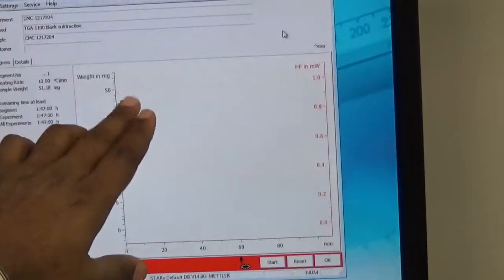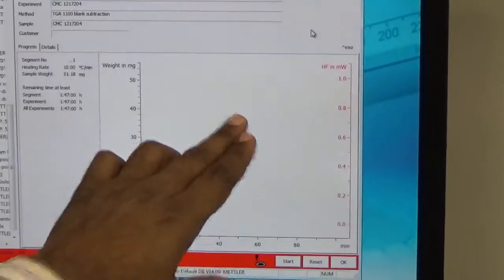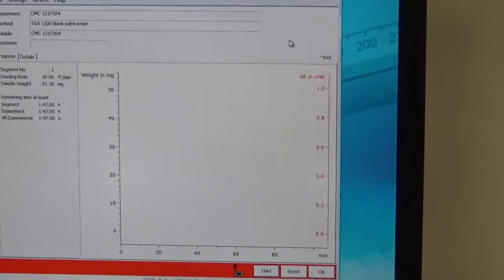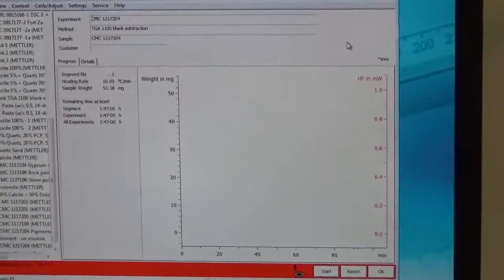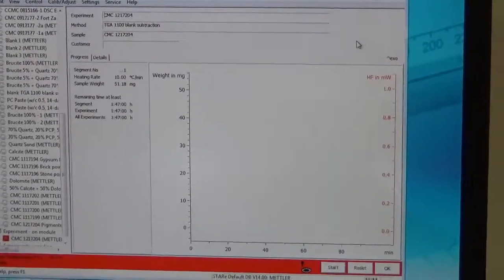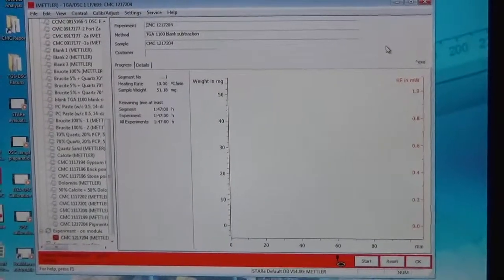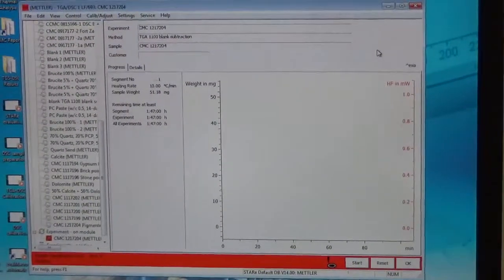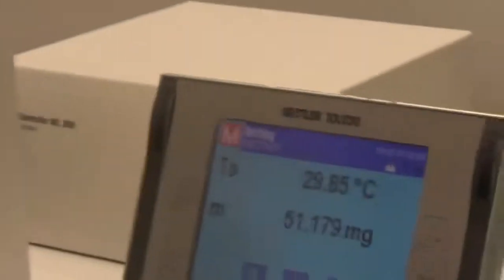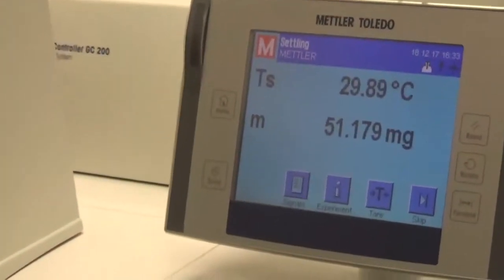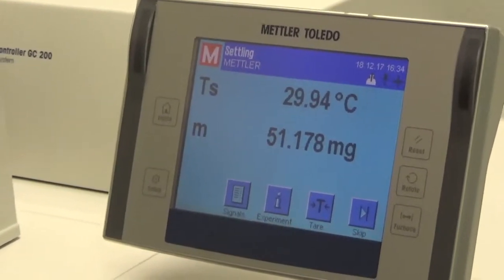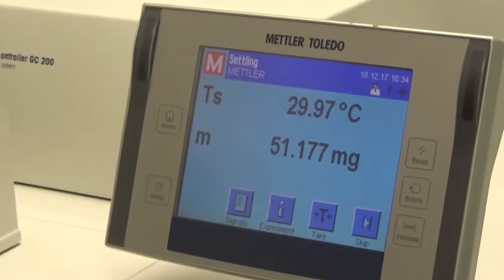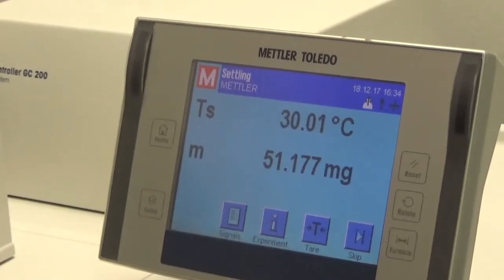When the plot starts, it shows the weight changes, and when there is a significant weight change, it gives a downward endotherm. With increasing temperature, different phases dehydrate and decarbonate at different temperatures and show up as characteristic endotherms in the TGA plot. When you take the first derivative of the TGA plot — which is the DTG plot — it clearly shows the peaks where the weight changes occur in the TGA.